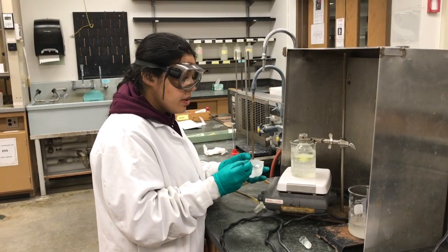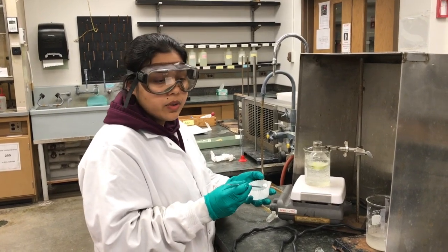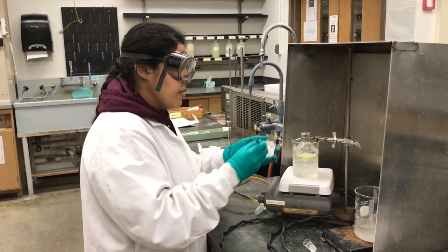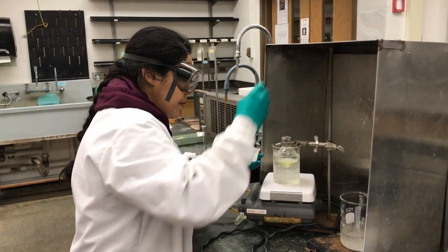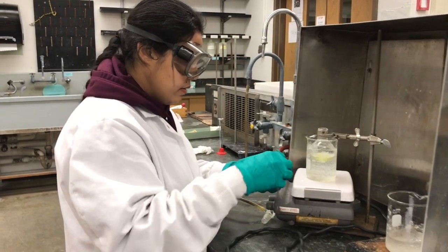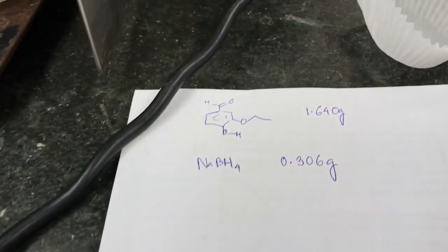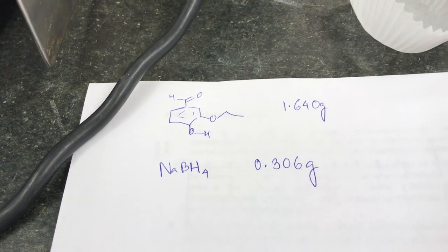So we have stirred our ethyl vanillin with sodium hydroxide for about 5 minutes now in an ice cold condition. Now we're going to add our sodium borohydride portion-wise and stir it. You need to add it slowly. For this portion, we weighed about 0.306 grams of the sodium borohydride that we're currently adding.